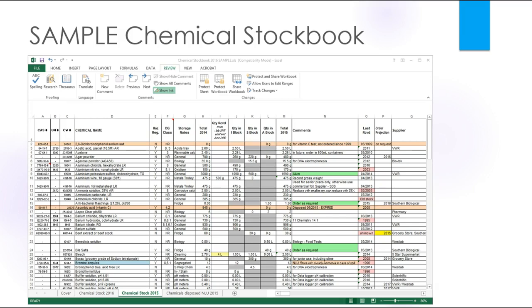More recently, I've found it invaluable to have the chemical manufacturer or supplier names on my register. This has been good to source the appropriate current safety data sheet, which complies with the new global harmonised system. But seriously, you don't need all this information on your chemical stock book. This is just something that I've developed for me. So I recommend you develop your own table headers.